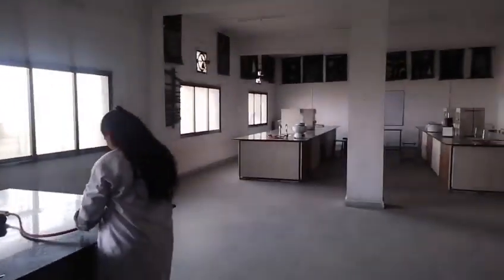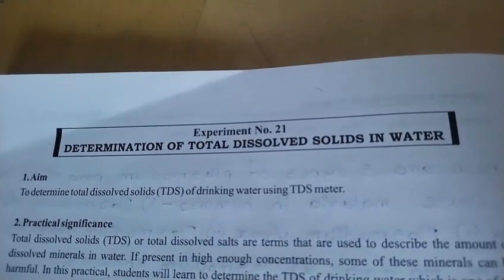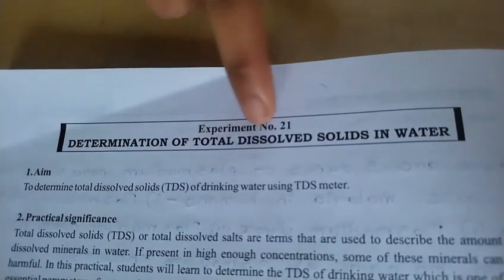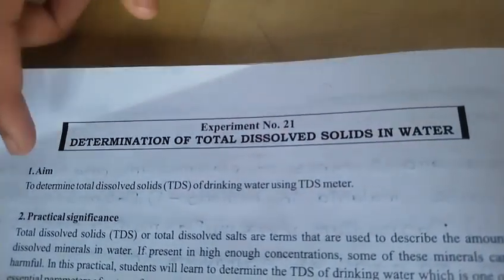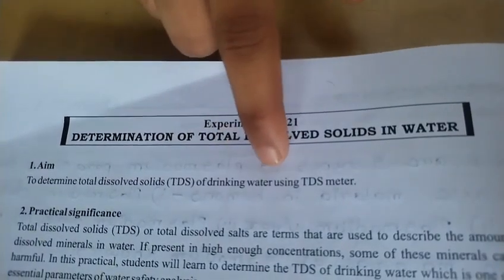Today we are going to perform one of our social pharmacy experiments, determination of total dissolved solids in water, aiming to determine total dissolved solids, that is TDS, of drinking water using a TDS meter.